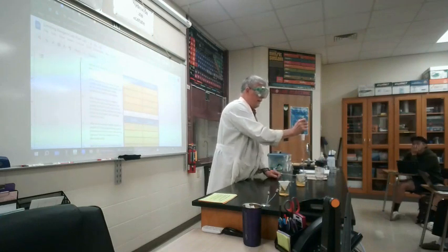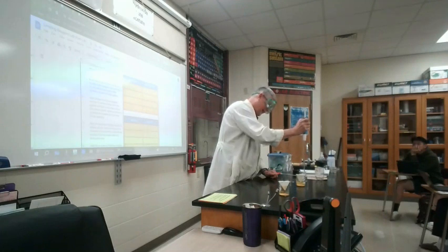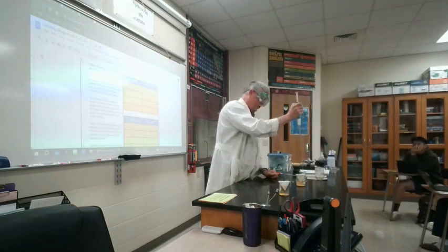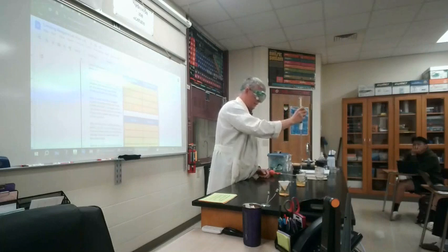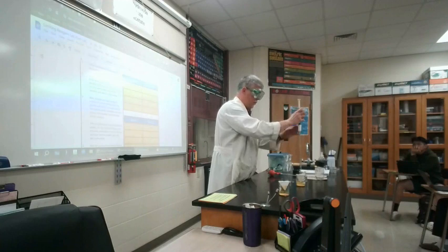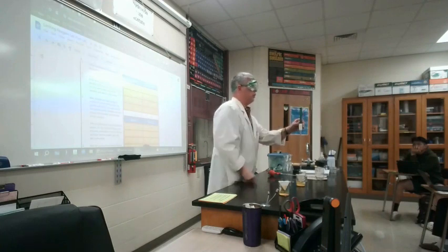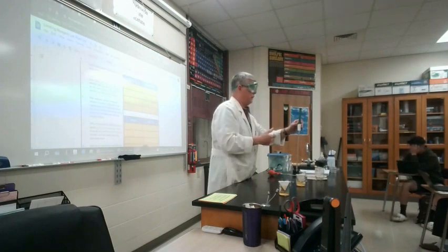You twist the dial. That will cause this white handle to raise up, and that will cause the solution to go up inside the tube. When you get to exactly 10, ladies and gentlemen, you're going to hold it over your beaker, and you are going to press the top of this lever and let it go until no more comes out. That's 10 milliliters exactly. Now, before the next group can use this, you have to push it down. Because if you don't, it's limited how far it will go up, and it will not pull up another 10 milliliters.